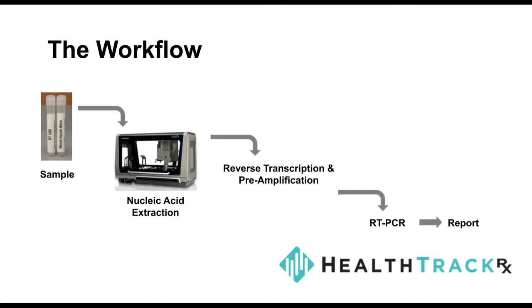And again, like I said, as a business decision, when we looked at developing the LDTs, what we realized is that running these extensive panels would make sense at a certain patient volume or sample volume. And for that, it became very apparent very soon that we would need automation at different levels of the workflow. And one point, which was proving to be a big bottleneck, was the extraction of the nucleic acid from the samples.